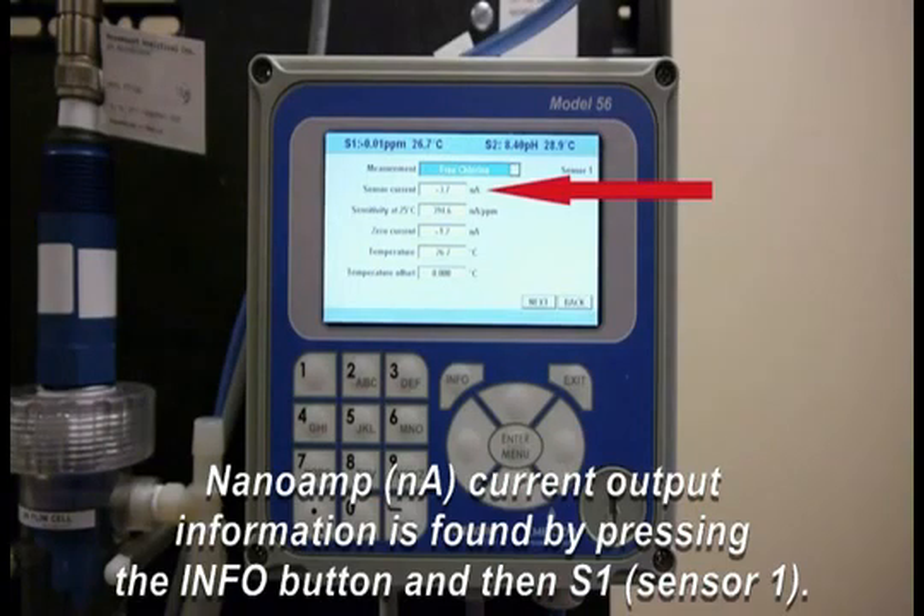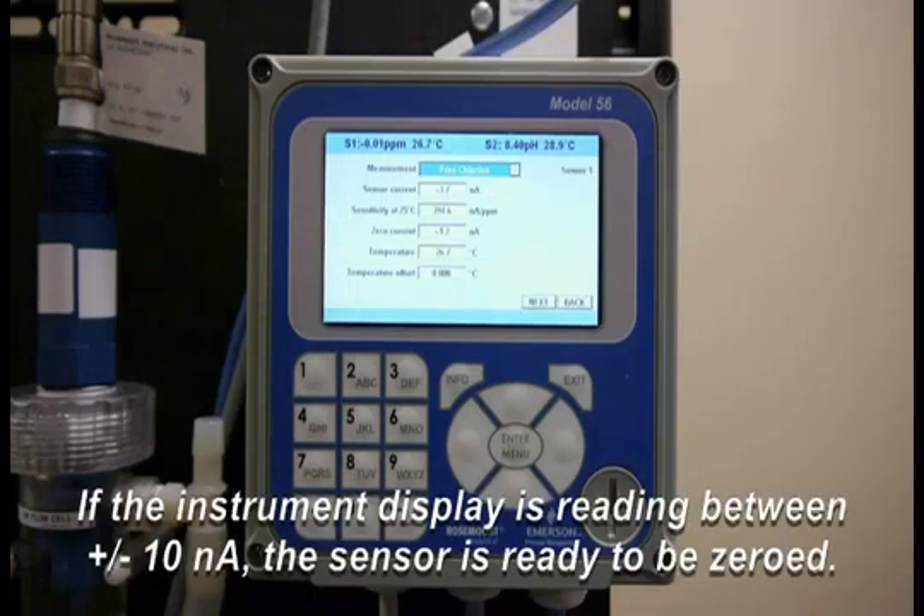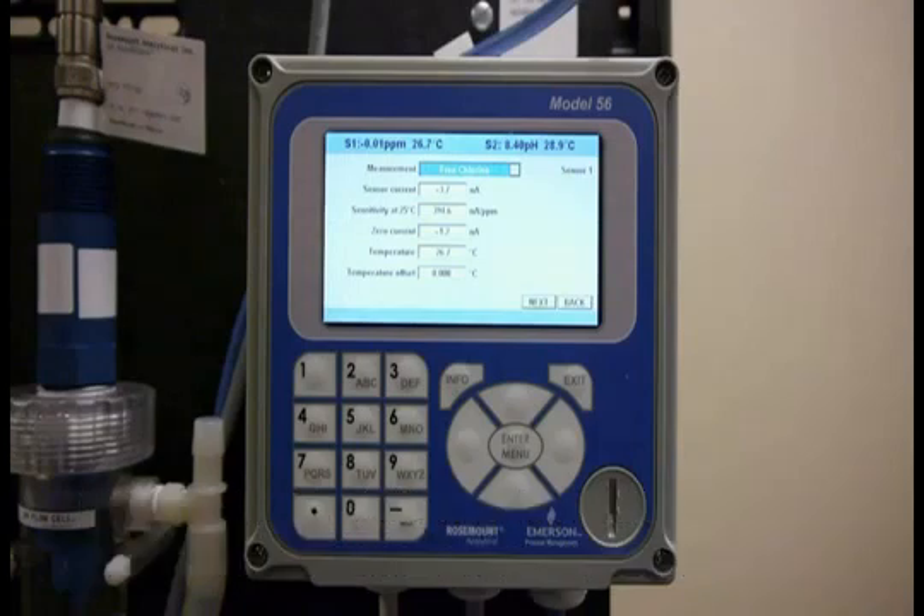It's right now reading at negative 3.7 nanoamps — that's the second line item on the display. The key is it has to be between negative 10 and 10 nanoamps, and it's been stable for quite a while, so I know it's ready to be zeroed. So I'll go on to the next step to actually zero the sensor.